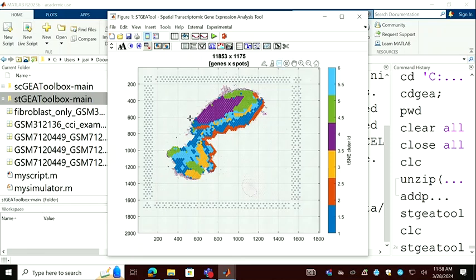So all the spots in this cluster group together in that region. And all the spots at this boundary have been clustered together, not using the spatial information, but just using the profile of the gene expression. And then you look at where they are located.